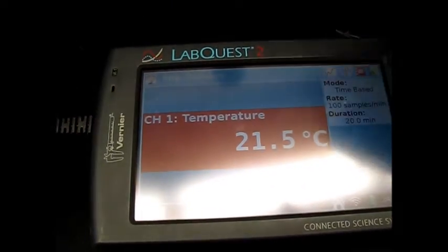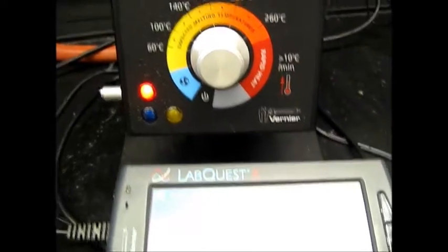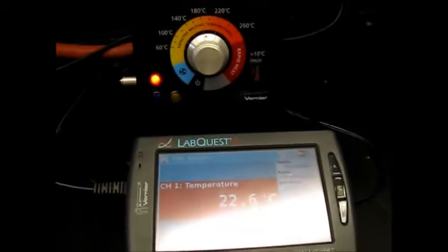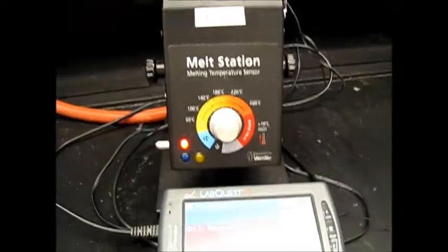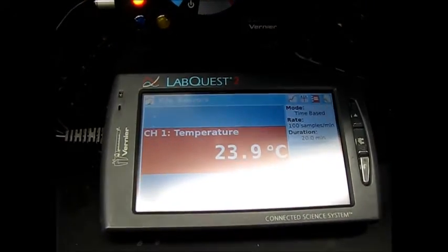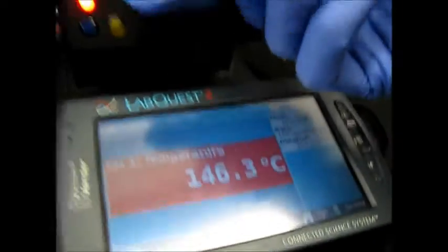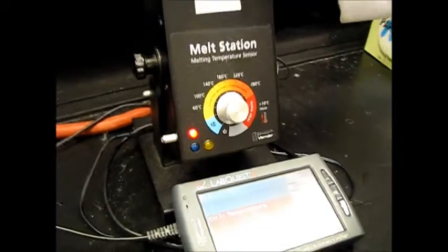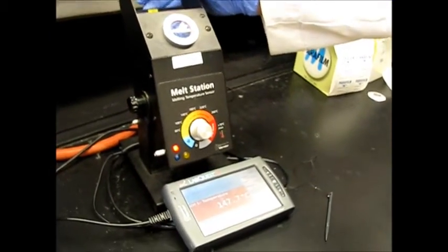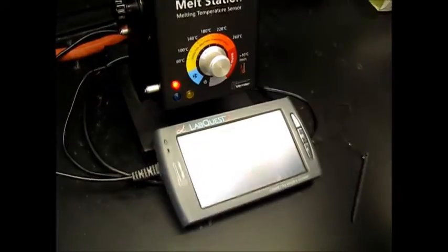So the literature value is around 150. We're going to turn it up to around 180 just to get it warming up really quickly. We'll slow it down once it approaches 145, 150, just so that we can actually get an accurate number for it. So we're at 145 right now. It is still steadily rising. I'm going to turn it down just a little bit. The melting point range is 153 to 154. That's the literature value, so we are approaching that. I'm going to keep a close eye on it as it reaches this range.